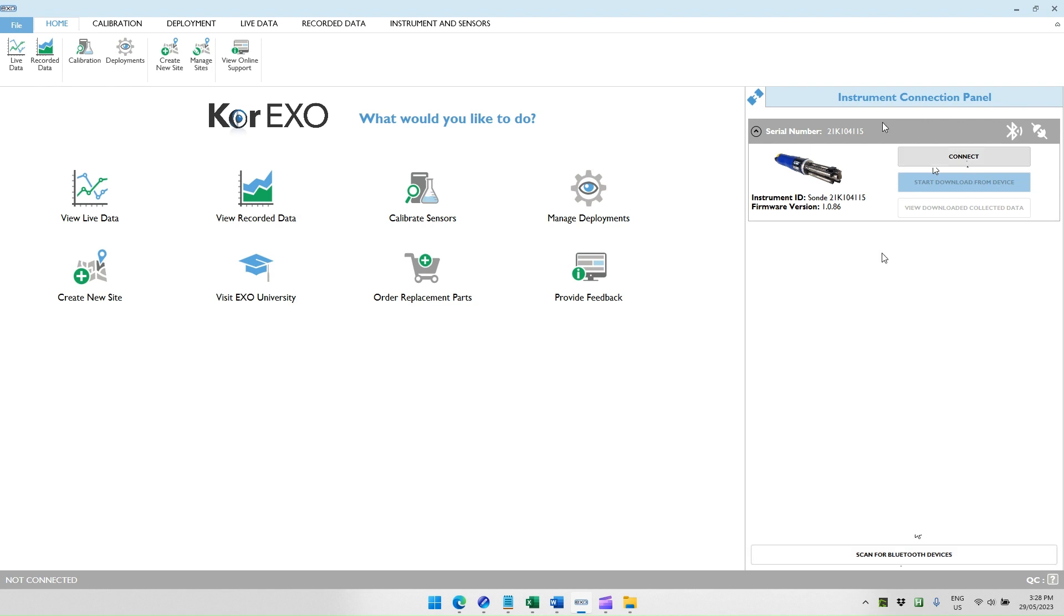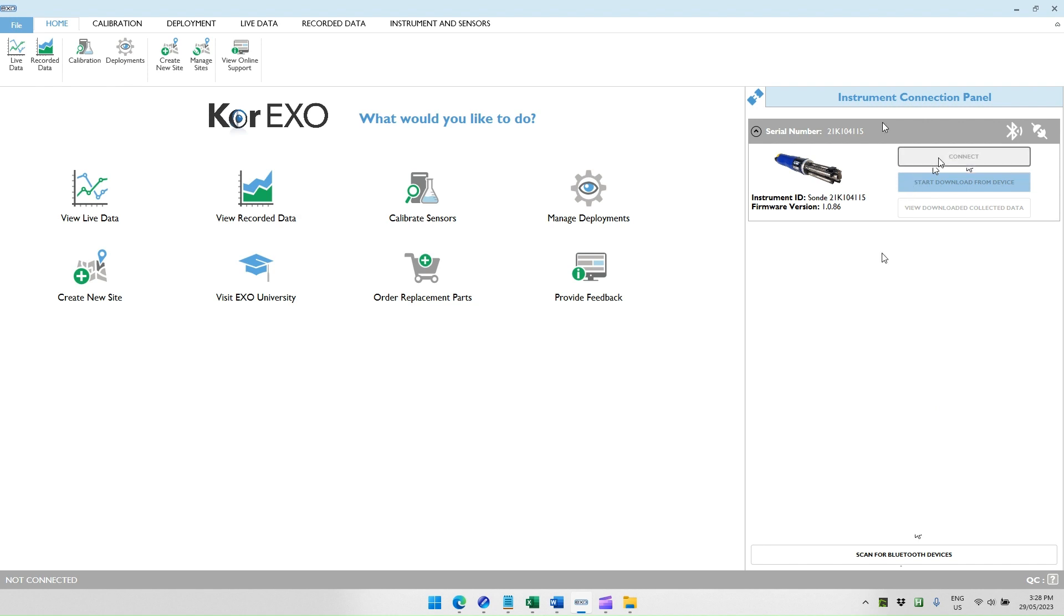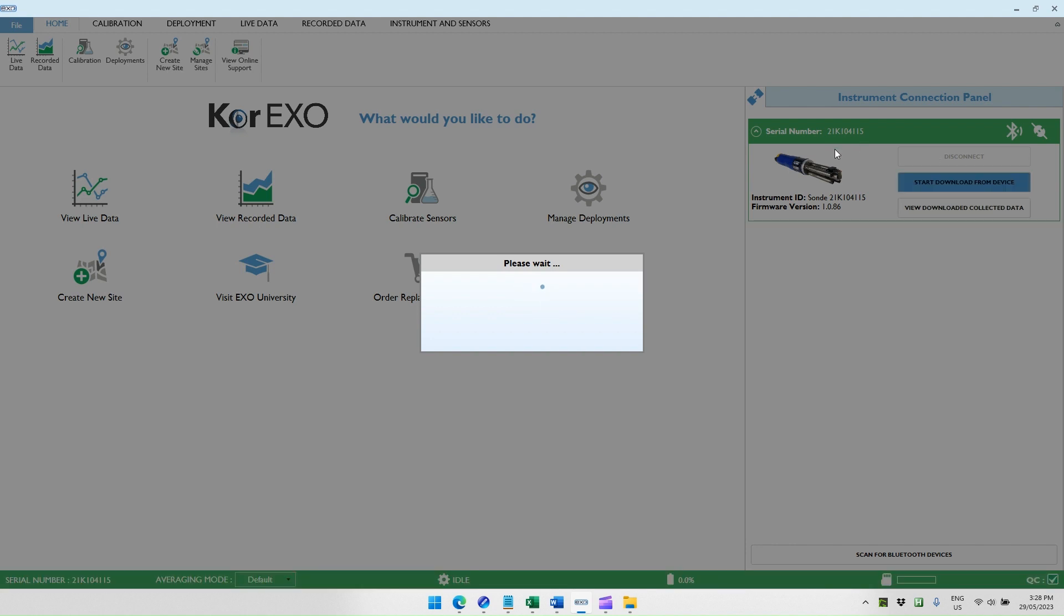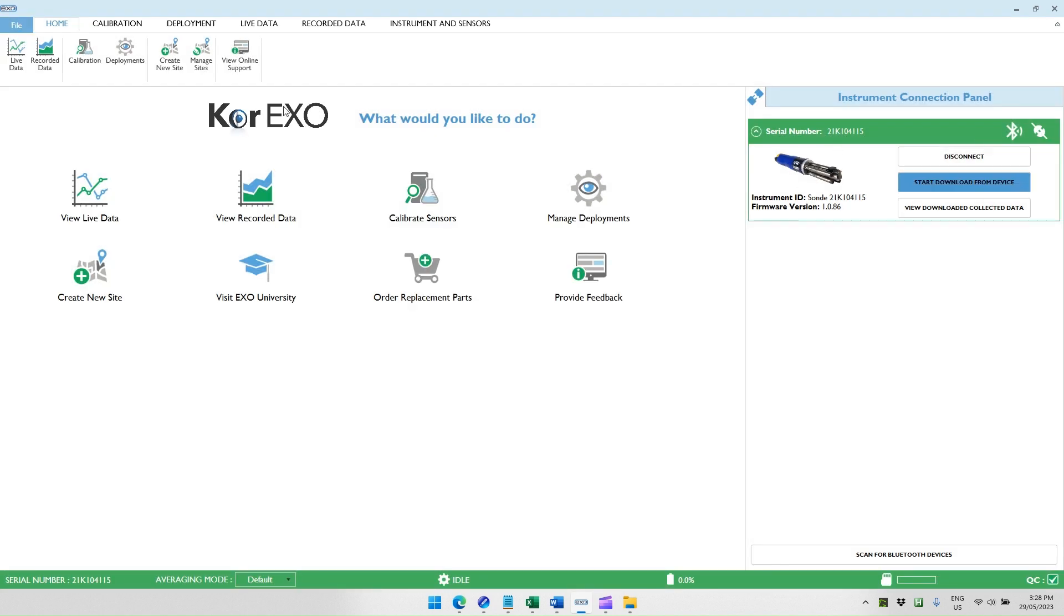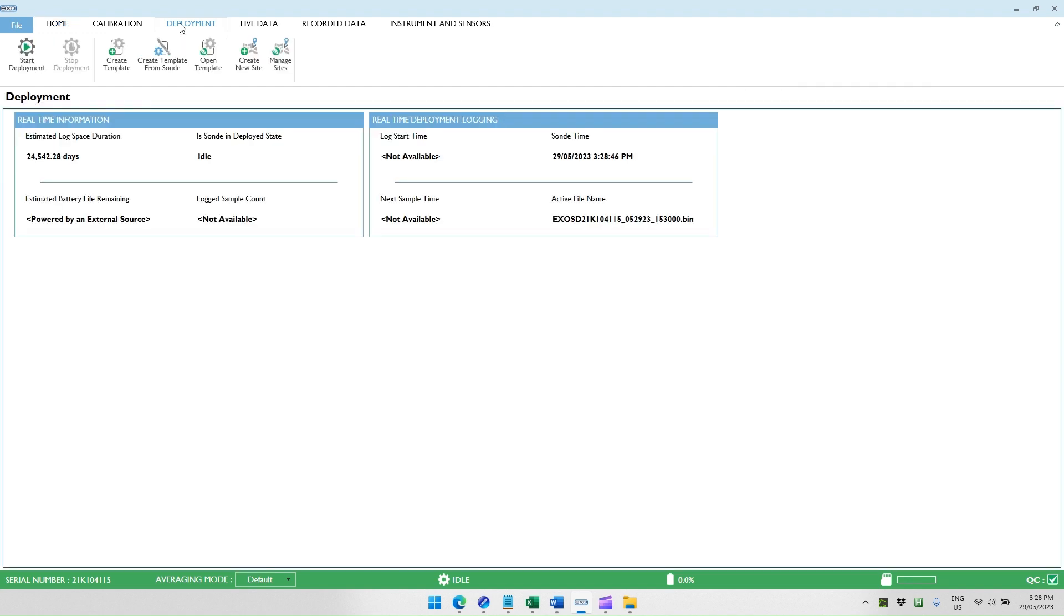Once the sonde is appearing in the instrument connection panel, use the connect button to connect. When that happens, this area will go green, and then we can go to the deployment tab. This assumes that we already have a sonde that is calibrated, we've looked at the data, and we're happy with the data and ready to deploy the sonde.